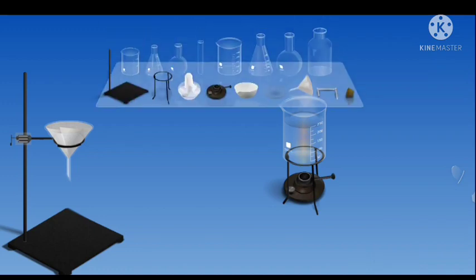We'll talk about another equipment. This is called china dish. It is used to take chemicals, to heat and to conduct the many practical. This is called conical flask. Already we have used conical flask in the case of filtration process, and this is called round flat bottom flask, and they are also found in different volume capacity: 250 ml, 500 ml.